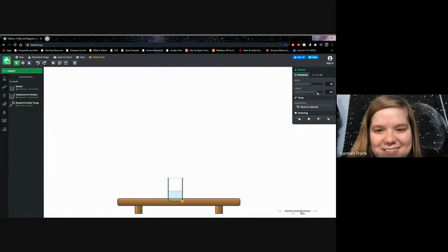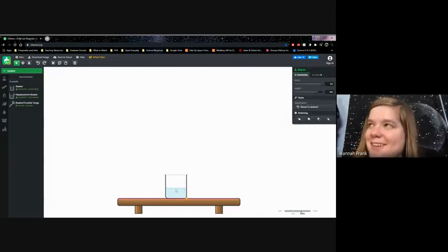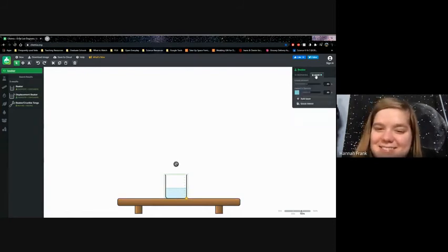I want to make it bigger. There. Wow, that's a good one. Okay, so is that the amount of liquid that we usually would want in a TLC? No, we want a lot less than that.